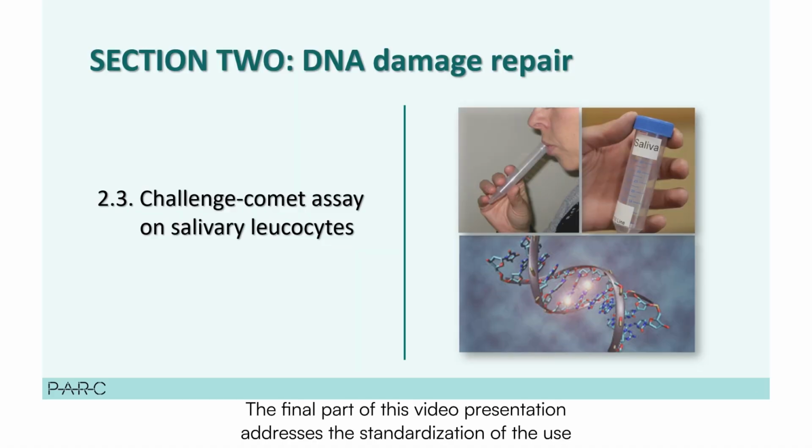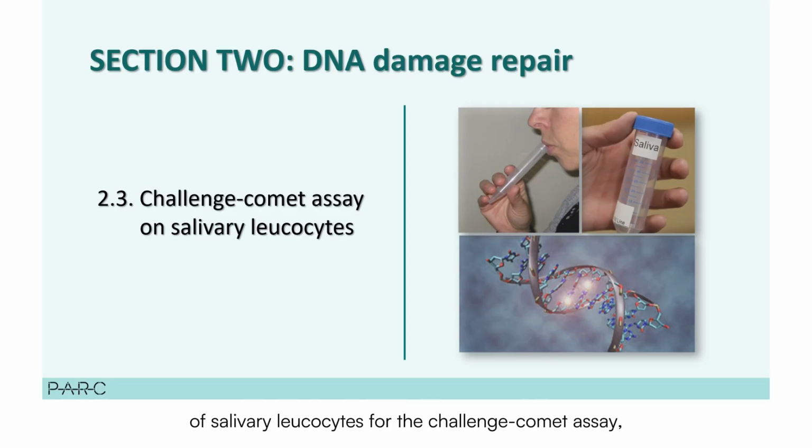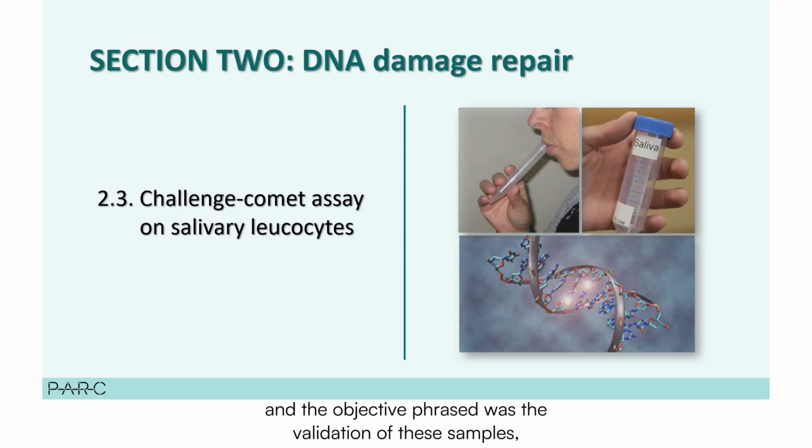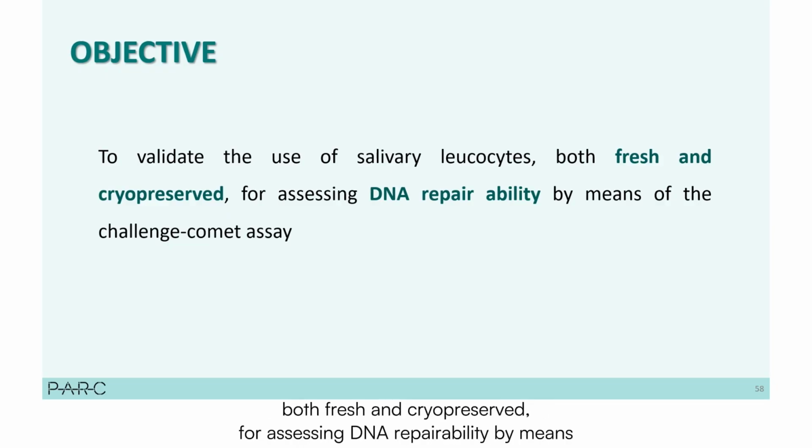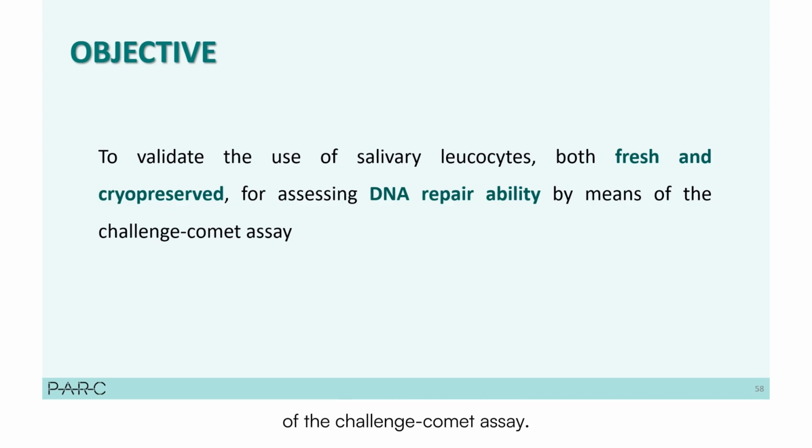The final part of this video presentation addresses the standardization of the use of salivary leukocytes for the challenge-comet assay. The objective raised was the validation of these samples, both fresh and cryopreserved, for assessing DNA repairability by means of the challenge-comet assay.